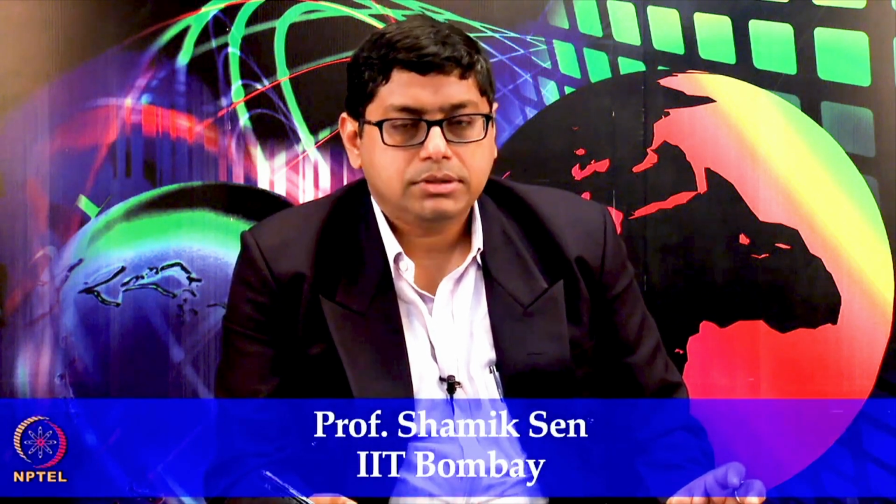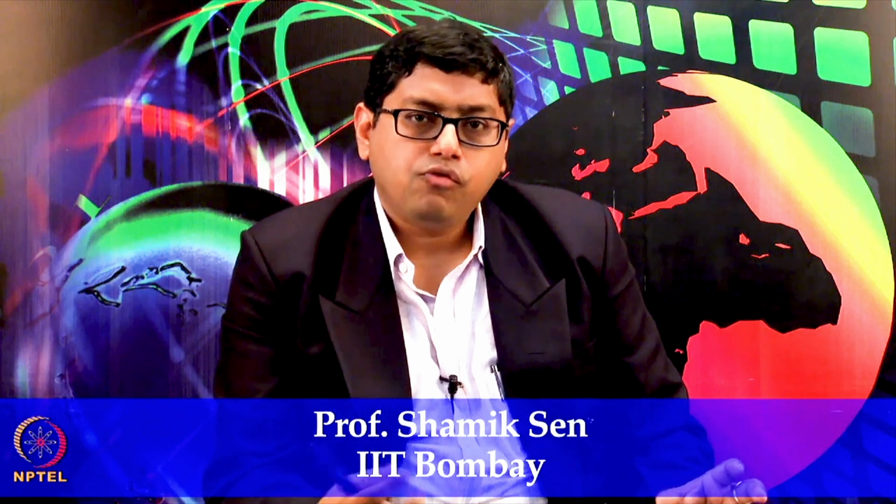Hello and welcome to our 10th lecture of our NPTEL course Introduction to Mechanobiology. So, in the last two lectures I have been discussing how we can probe protein unfolding using AFM, and how we can use that for studying how forces affect the unfolding dynamics of proteins, taking the specific example of fibronectin. Let me first start with a brief recap of what we discussed in the last class.